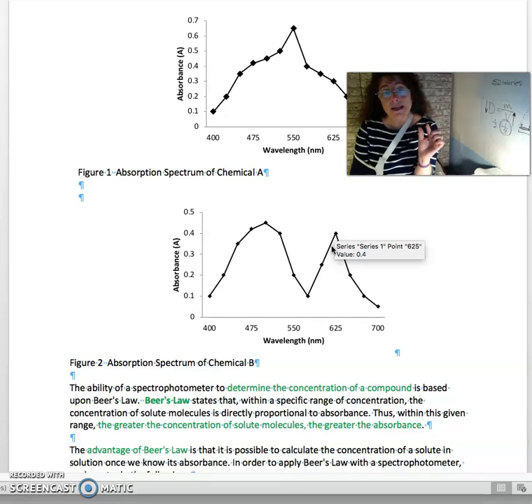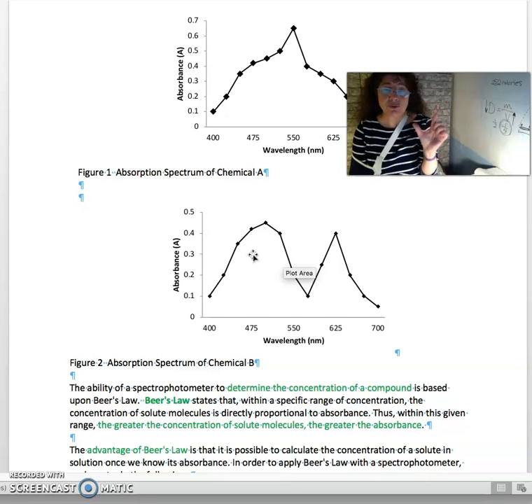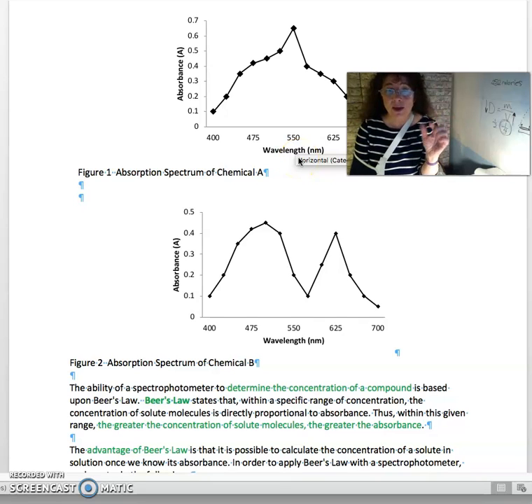All right, so you get a feel for what you can do for the next range when we are narrowing down this fingerprint of this compound. As you narrow it down, you compare it to knowns, and you see that your chemical A looks a lot like a certain compound that you would flip through, and you flip through these knowns to get something that shows a peak just like this. Or when you get it back down, you might see that this peak actually divides into 520 and 530, but you don't see it over this broad area. So you go narrower and narrower and narrower.